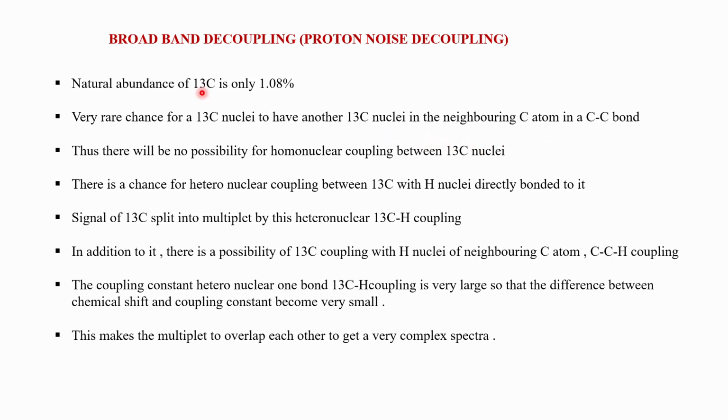In this video, I will be discussing one of the important decoupling techniques of carbon-13 NMR spectra, that is broadband decoupling or proton noise decoupling. Before jumping into this video, we have to know some of the important features of carbon-13 NMR.